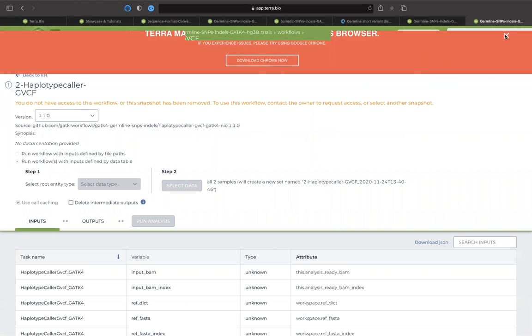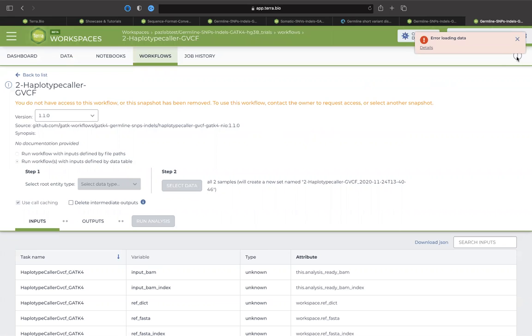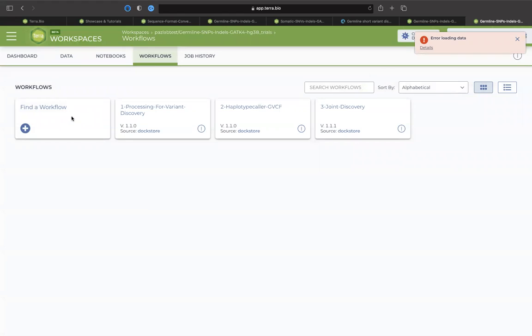All right, so we can edit. What we could do actually is to find a workflow.